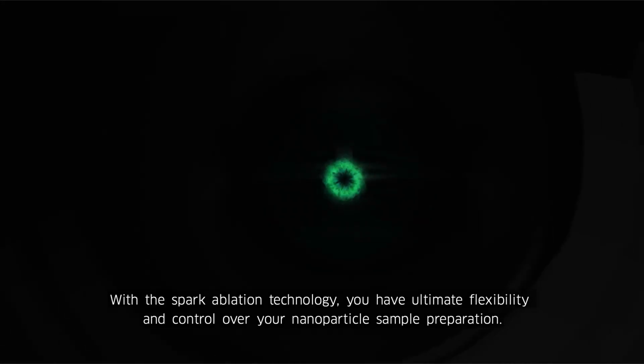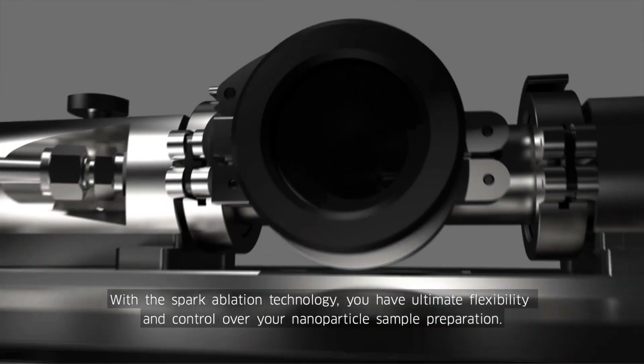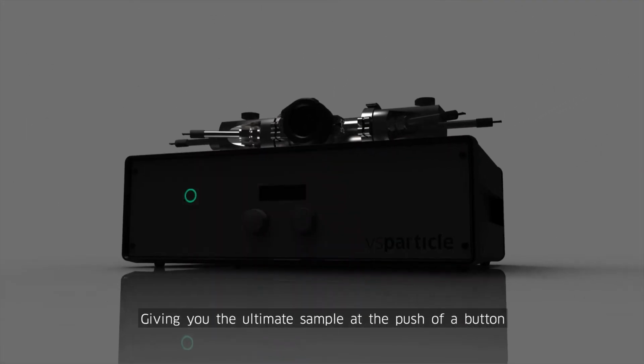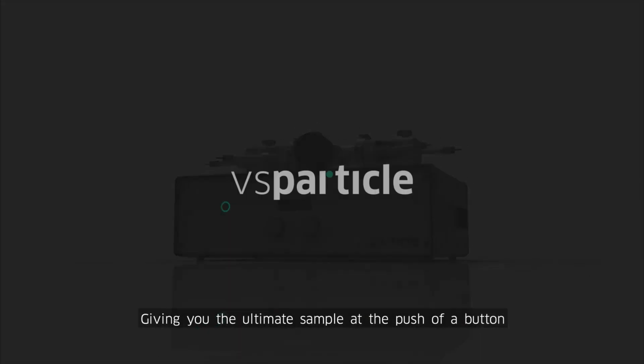With the spark ablation technology, you have ultimate flexibility and control over your nanoparticle sample preparation, giving you the ultimate sample at the push of a button.